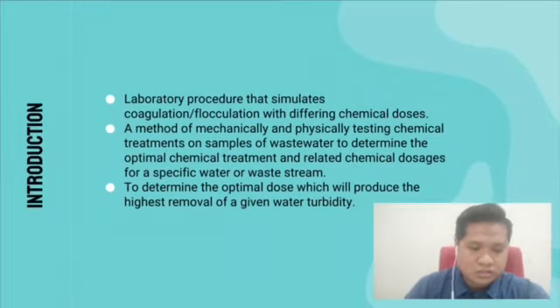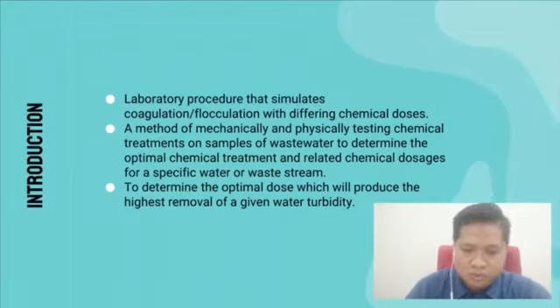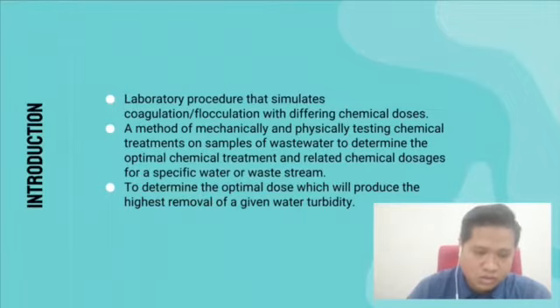Introduction. A jar test is a laboratory procedure that simulates flocculation with differing chemical doses. It is a method of mechanically and physically testing chemical treatment on samples of wastewater to determine the optimal chemical treatment and the related chemical dosage for a specific water or waste stream. The purpose of the procedure is to estimate the minimum coagulant doses required to achieve certain water quality goals.